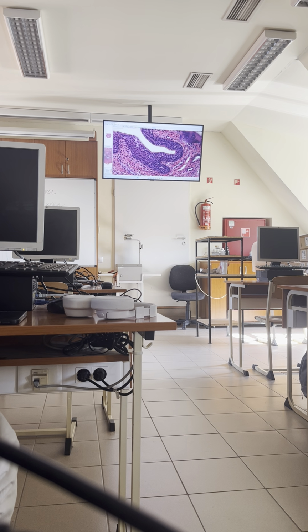So this is what you wanted, okay. Also, the fossa is ectodermal, right? The epithelial fossa is ectodermal. You know, that's a transition, as the type of the epithelium suggests.